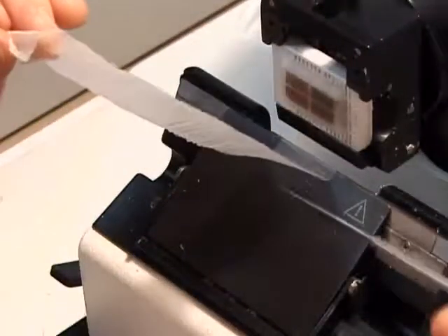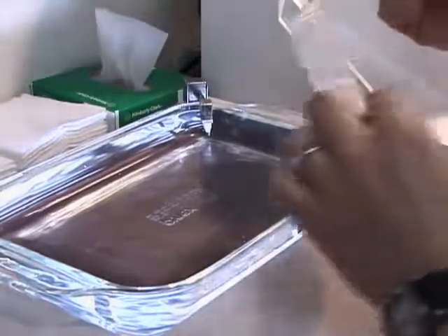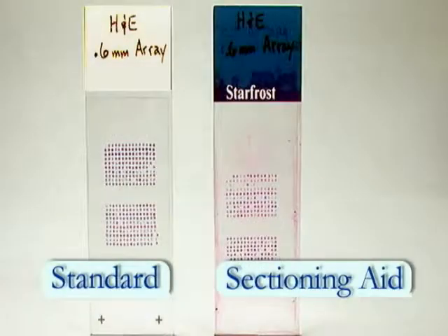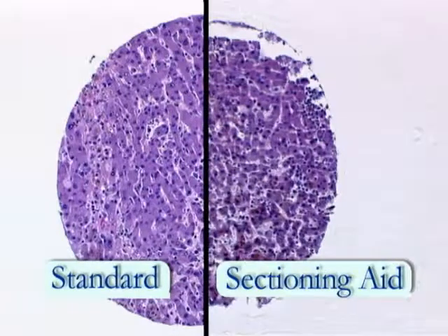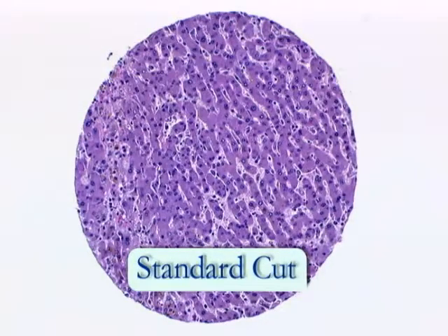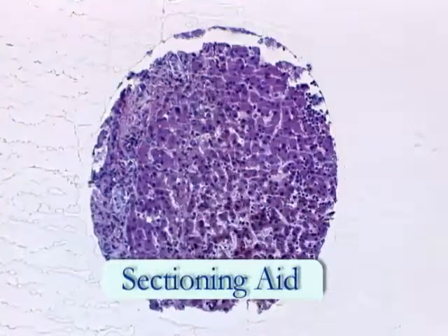Which technique you choose depends on your abilities. There is a different quality between the two. If you choose the sectioning aid system, you will want to use a non-alcoholic eosin to minimize background staining when doing an H&E. When comparing both punch methods, it is apparent that the standard microtomy is a better way to go. The sections are cleaner and cells are more defined. The sectioning aid punch is generally thicker and chattered.